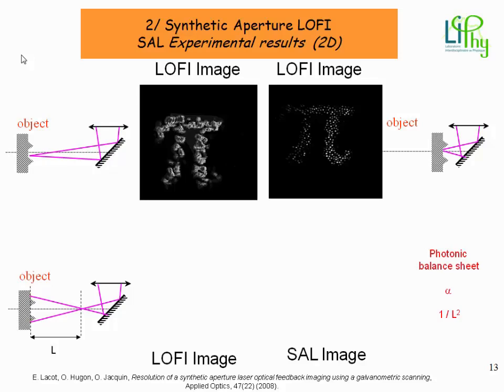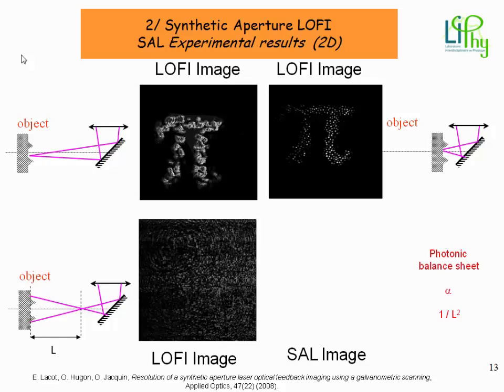The second image, which is shown here, is an image of the same object, but obtained with a lens having a lower numerical aperture at a longer observation distance. And as a result, due to the lower numerical aperture, the silica beads can't be resolved, and only the P-shaped hole is distinguishable.